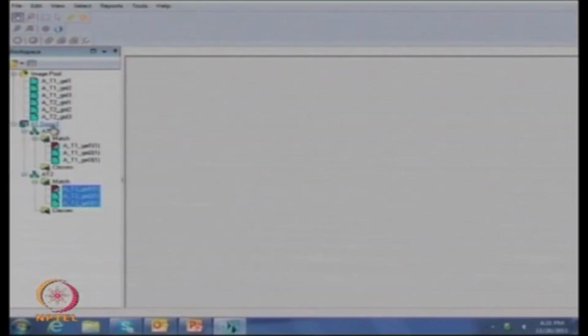Another feature is available here. So now more spots are visible and more sharp. Otherwise there is an option that you can select a particular area, then change the parameters. Now you can see real-time changes in those particular spots. Now display them. Now you have all of your gels here.